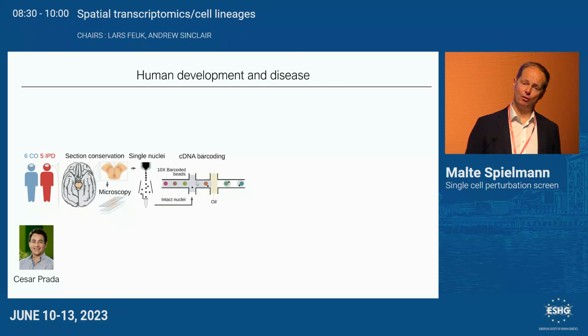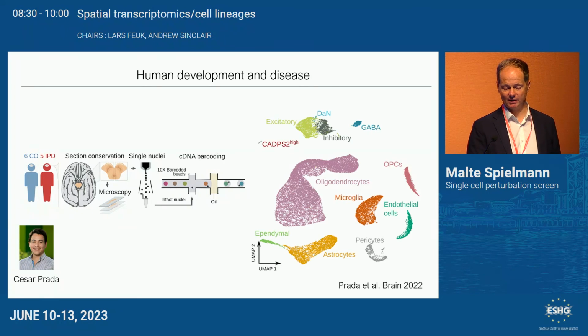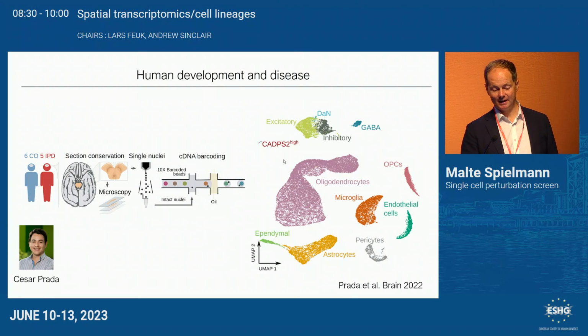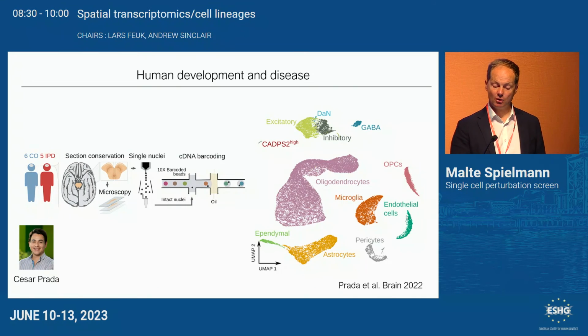And like I told you before, you don't need to know much about a tissue of interest, but you just do clustering. And this is what we did. And saw that there's all the major cell types of the midbrain, because these were tissue sections of the midbrain, including the substantia nigra, which is thought to be affected in Parkinson, because this is where the dopaminergic neurons are located. So we were happy to see that there's lots of oligodendrocytes, astrocytes, microglia, but there's also dopaminergic neurons, but very little, so just a few.